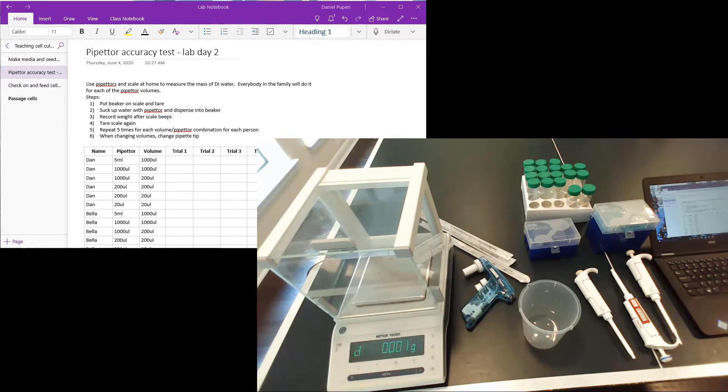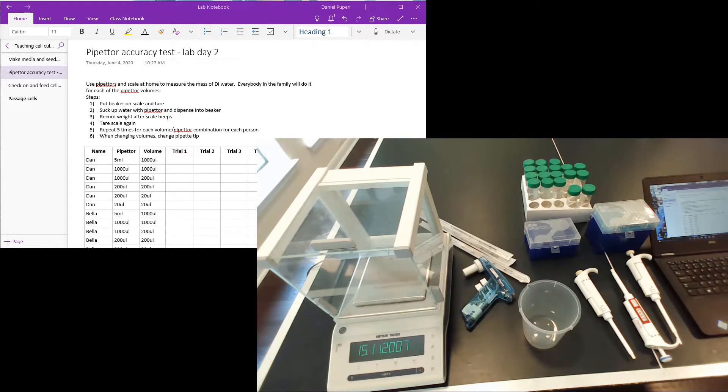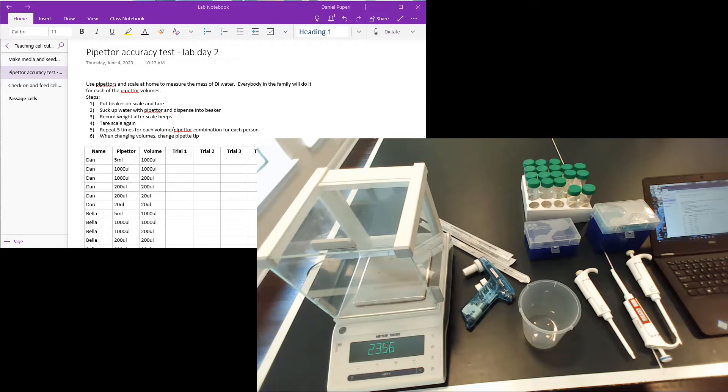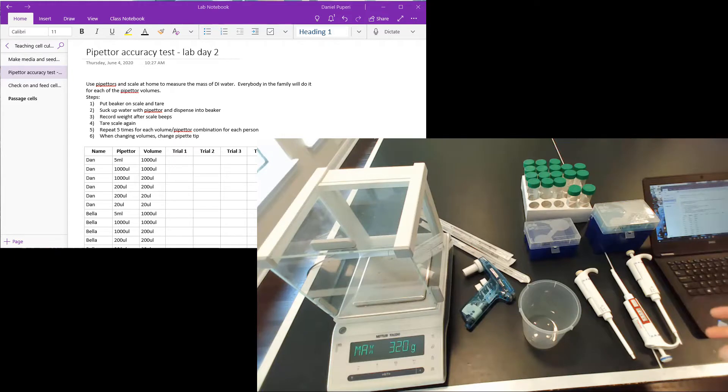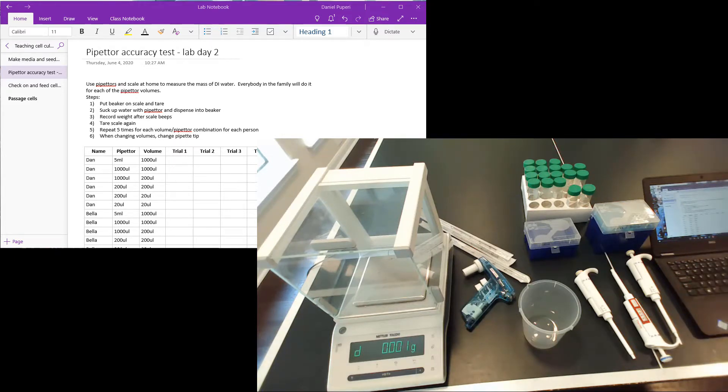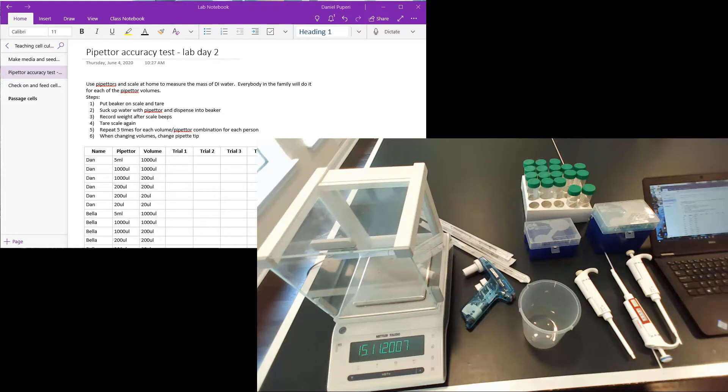I brought all this stuff home so I can do the pipetter accuracy experiment for you guys. I made sure I cleaned everything off well with ethanol so that I wouldn't bring any nastiness to my house. So I'm not going to have to use gloves or anything because everything has been pretty much cleaned.